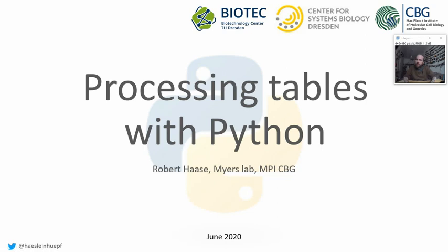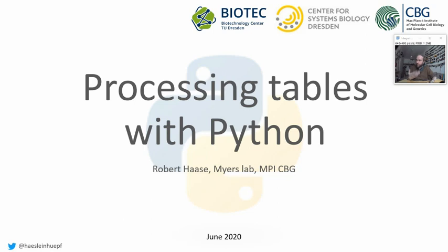Welcome back, everyone, to the lecture about applied bioimage analysis. In this part, I will show you how to process tables with Python. As you may have realized earlier during the ImageJ macro part, but also during the scikit-image part, we basically do image analysis to derive a table of measurements from our images, and then we continue processing these tables.